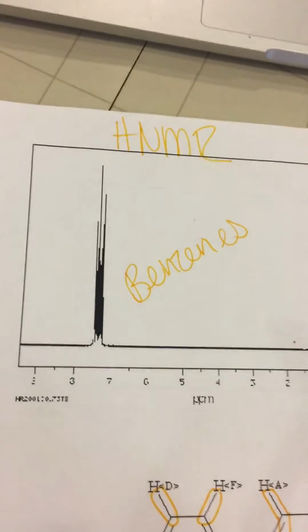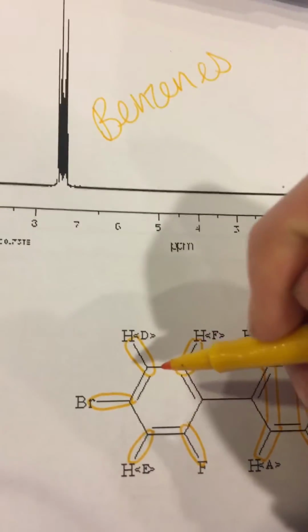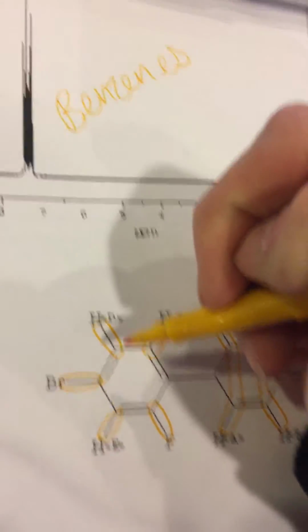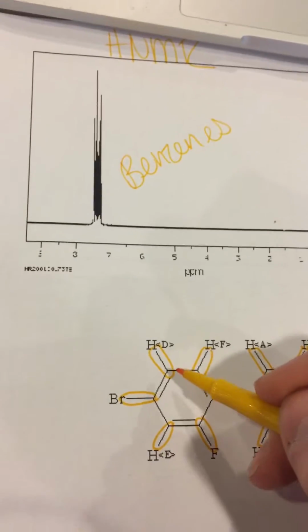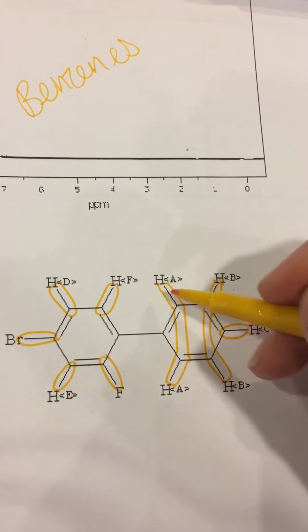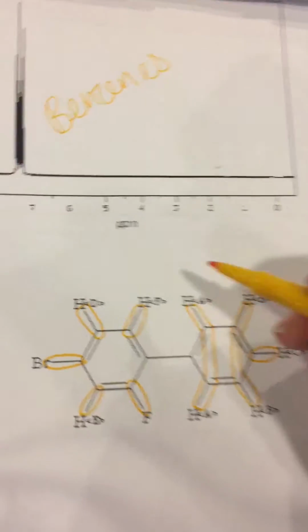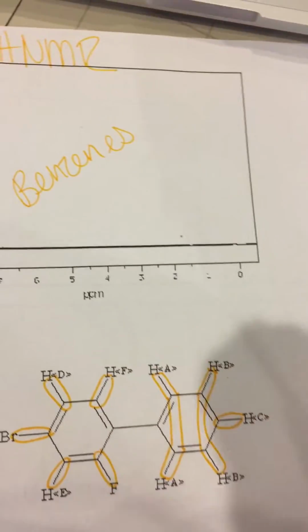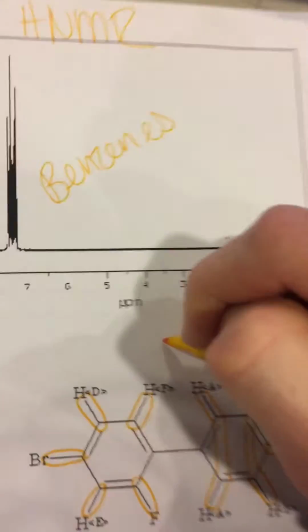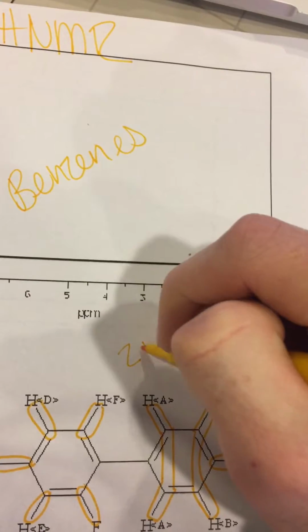Backtracking to the hydrogen NMR, since the other one's based off of carbons, this is based off of hydrogen. So, however this is, in the special environment right here there should be a hydrogen and a hydrogen, and basically you just count up the hydrogens within a special group, like 2, and then we're going to add 1.